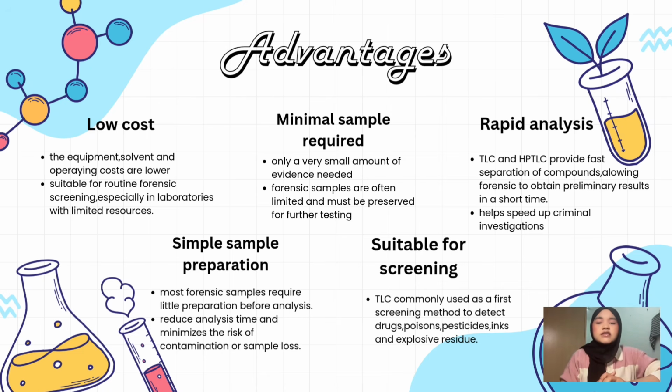Another advantage is rapid analysis. TLC and HPTLC can separate compounds quickly, allowing forensic scientists to obtain preliminary results in a short time. This helps investigators identify potential evidence faster and speed up the overall criminal investigation process.